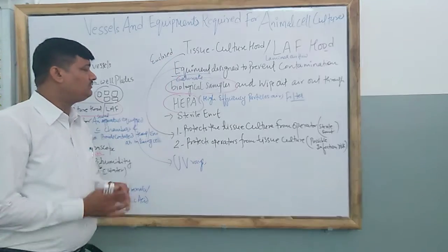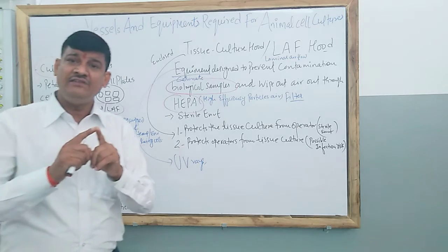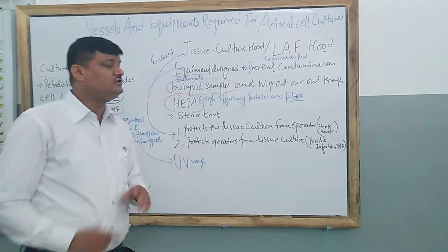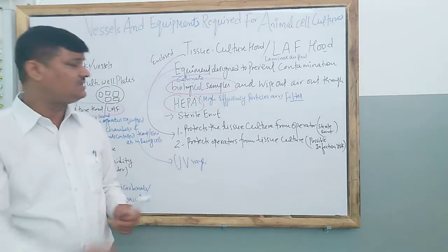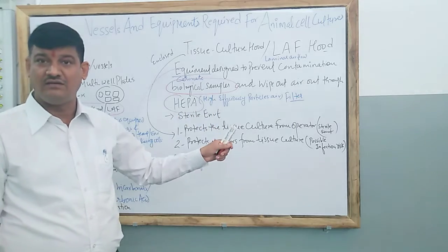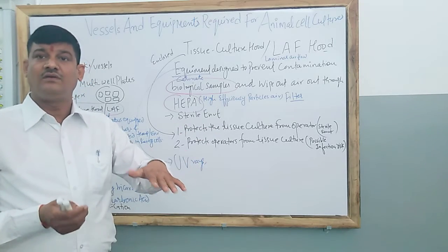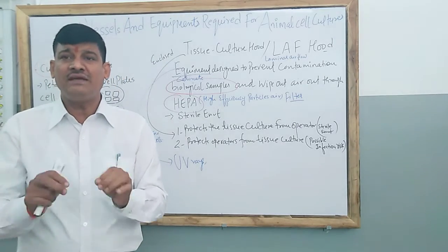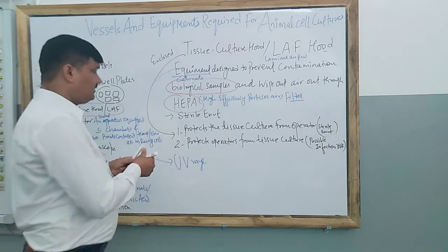Now, what is the other function of the tissue culture hood? It has two basic functions. Number one, it is made to keep the environment sterile, that is, to protect the tissue culture from the operators. The operator is the person who is working on the tissue culture or growing the culture. So it keeps the medium sterile. Number two, it protects operators from the tissue culture. The main purpose is to minimize the chance of infection risk.